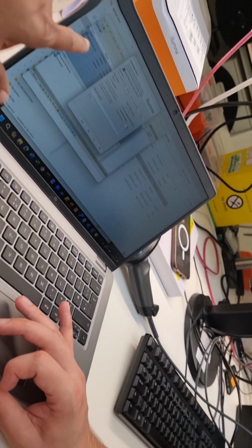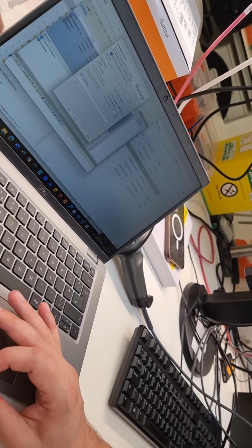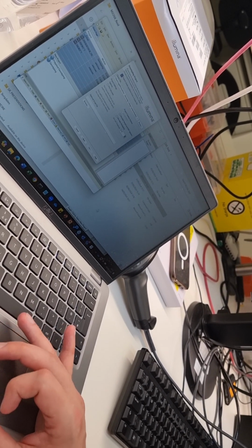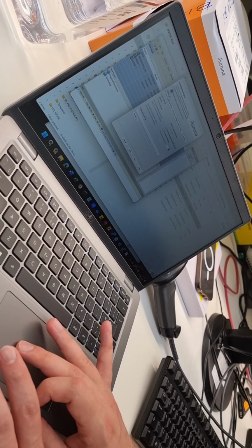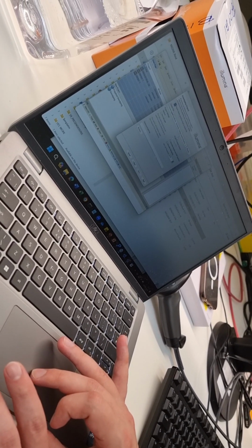The manifest, did you put the cluster file inside? Yeah, so that's the BPM one. What you do is on the sample sheet, you have under the manifest the name of the file, and it automatically finds it. Essentially, if you're running several different array types, it will just pick the most appropriate manifest from there. You saved it inside that. Yeah, that's fine. Then click yes to import the cluster file and select the cluster file.